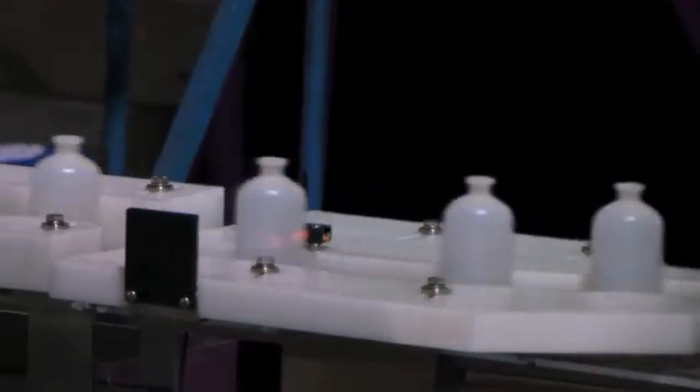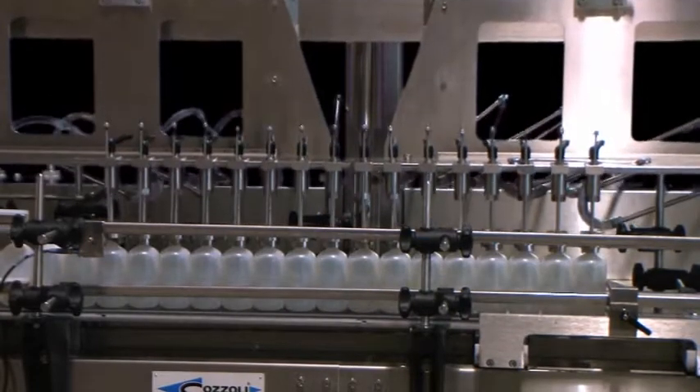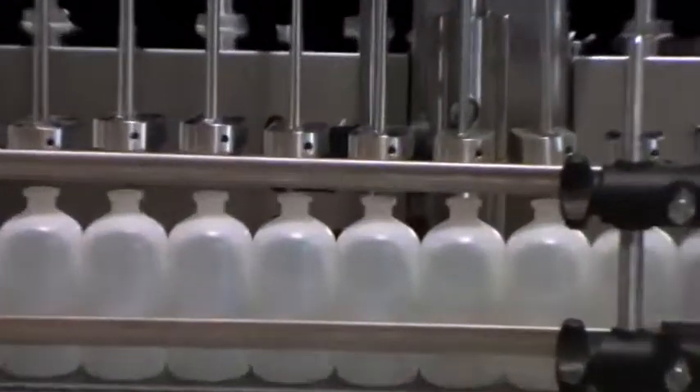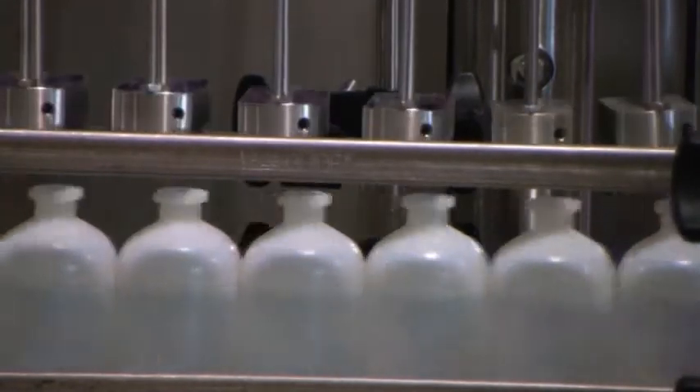The VR1640 incorporates a gating mechanism. Centering cones are used to precisely position filling nozzles inside the bottles. This is very important when running speeds up to 250 bottles a minute to fill product accurately.